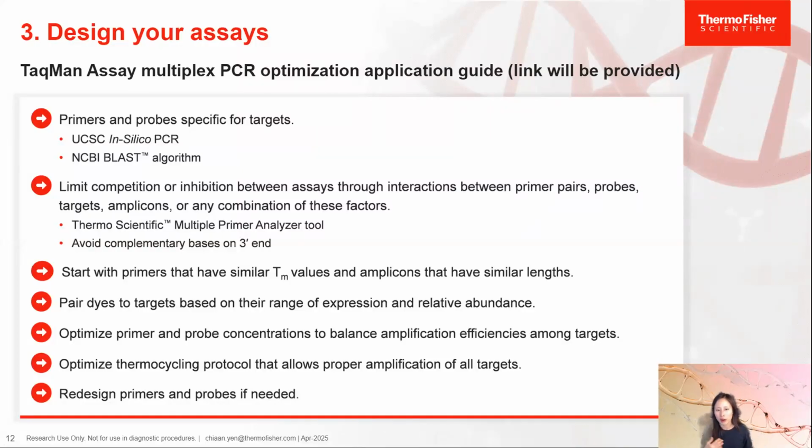So you can definitely vary the primer probe concentration once you test them, if you observe some discrepancies. Maybe something is showing non-specificity, or it's showing higher count than expected, so you might want to reduce the primer concentration. Or if you suspect you're putting too much probe that is generating non-specificity, you can try reducing that, or vice versa. If you have a target that's pretty low in signal, you could try increasing the probe concentration just to see if you can boost up the signal a little bit.